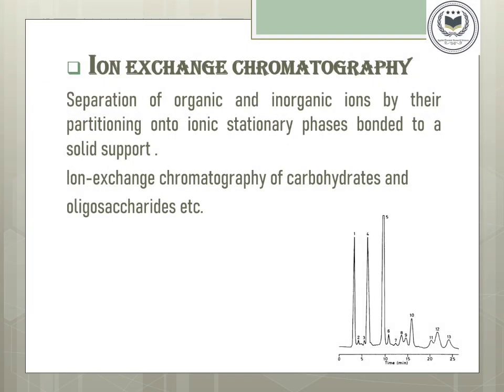Then ion exchange chromatography. It is separation of organic and inorganic ions by their partitioning onto an ionic stationary phase bonded to a solid support. Ion exchange chromatography is used for carbohydrates, oligosaccharides, etc.